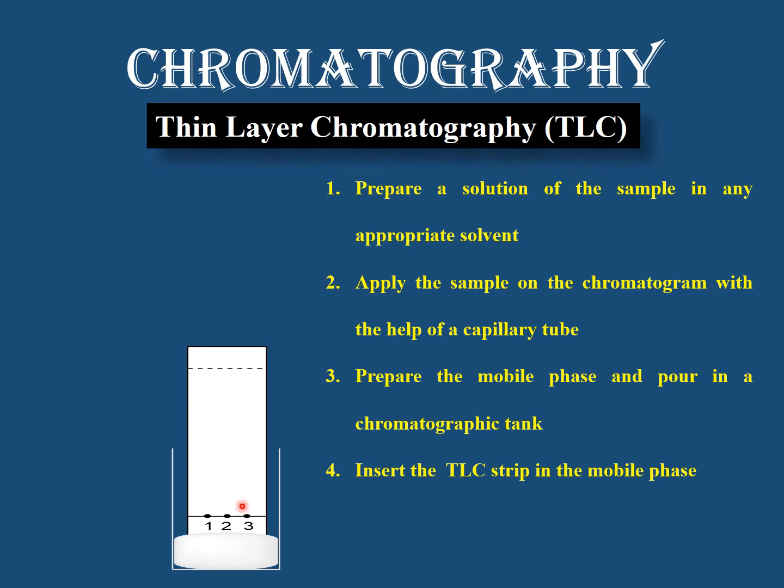stationary phase. So after a while, you would see that all those components which were applied here on this baseline have moved up with the solvent, with the mobile phase which has moved up to this level. This is the solvent front, and you can see that all of these components have gone up with the solvent system or the mobile phase up to different levels, and that depends again upon the solubilities in the mobile phase and the adsorption on the stationary phase.